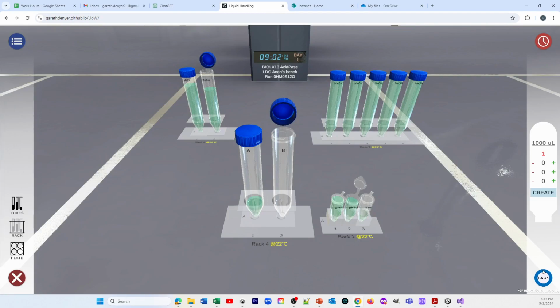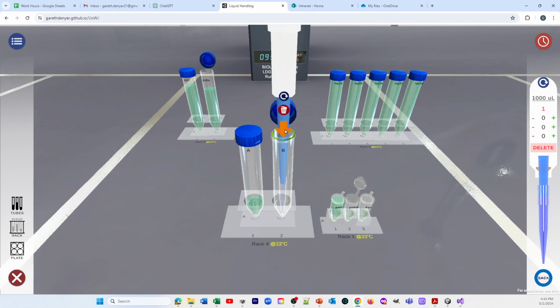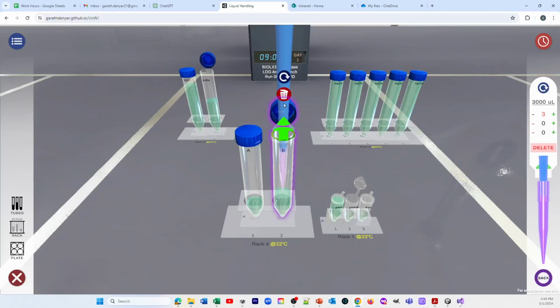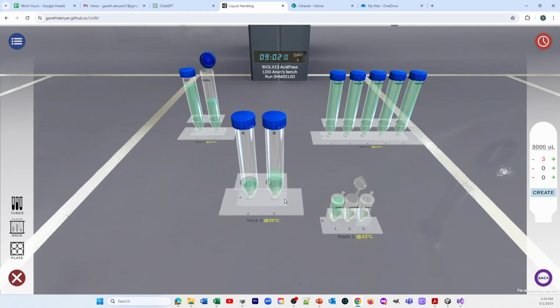Now we're going to put a mil of the pNPP in with 3 mils of buffer. So we're going to need to use a P5000 and suck up the buffer, put it in, close the lid and mix. Very important to mix. So we've got our substrate and our enzyme ready to go.